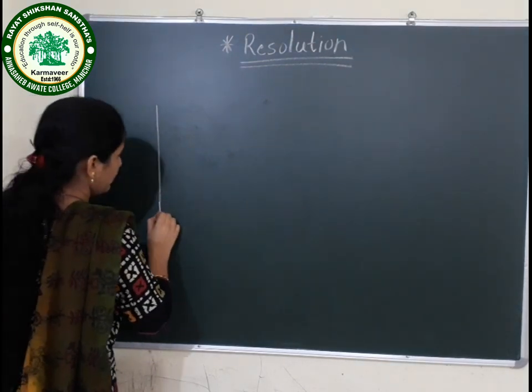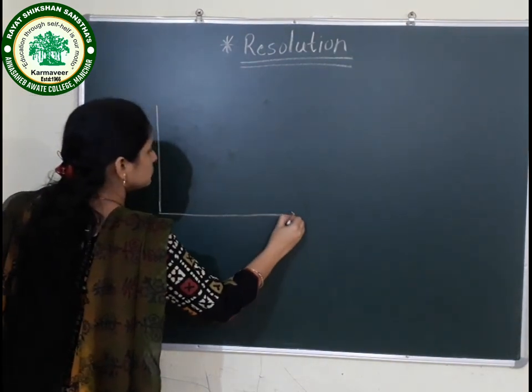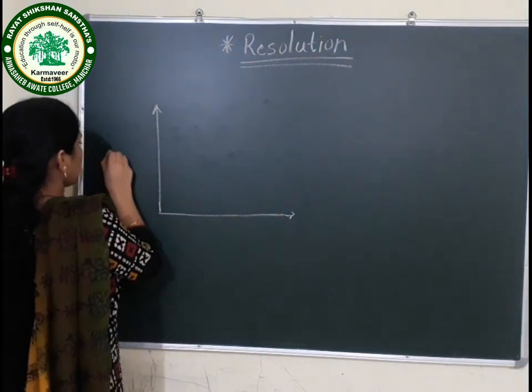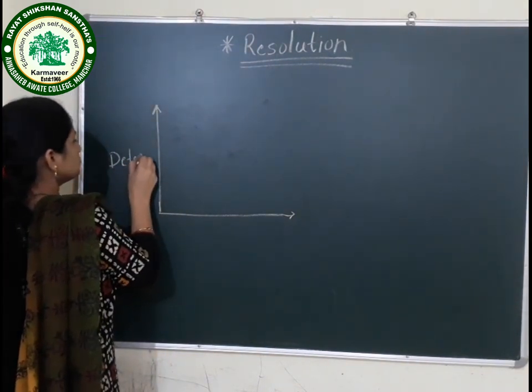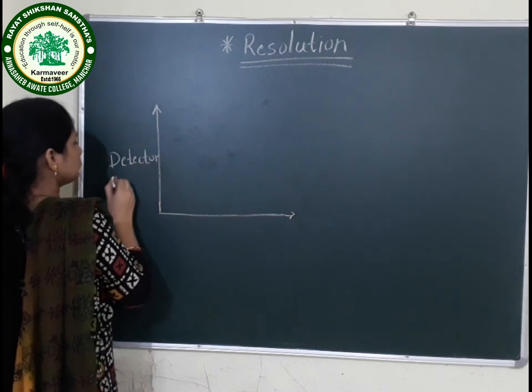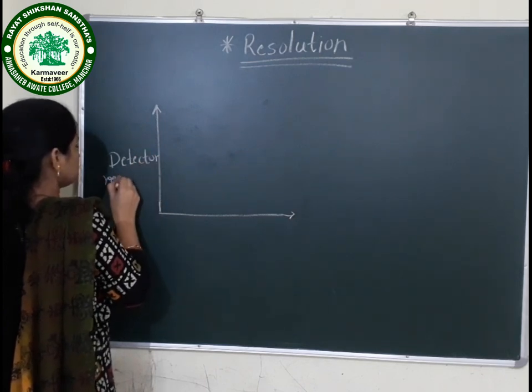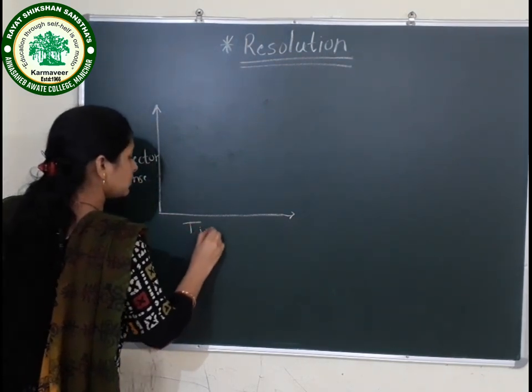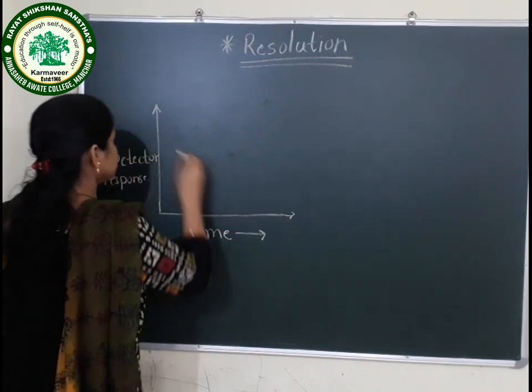This chromatogram is a graph we obtain from the detector response versus time.